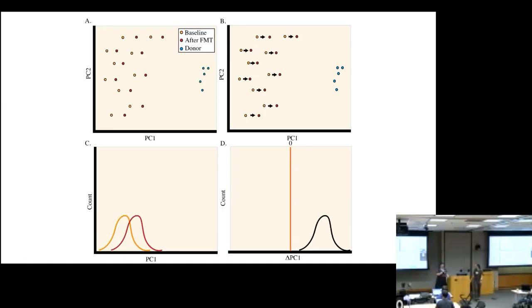Yeah, it also makes it really obvious how important it is to understand the metadata of your study. I've done analysis for collaborators and not fully understood the study or the outline, and you start looking at that subsection PCoA and you're kind of like, well, there's nothing here. But then once you dive in and understand the metadata and the study better, you really highlight those exciting parts of it.